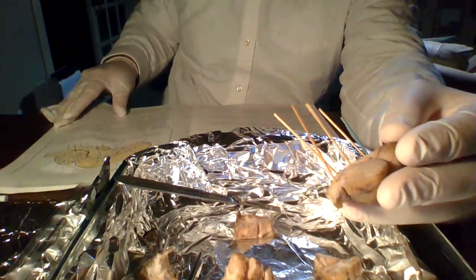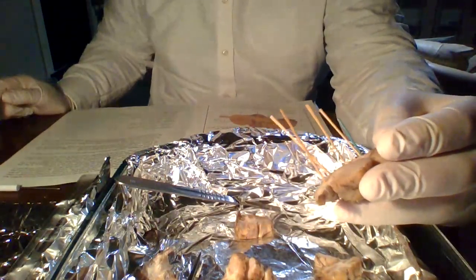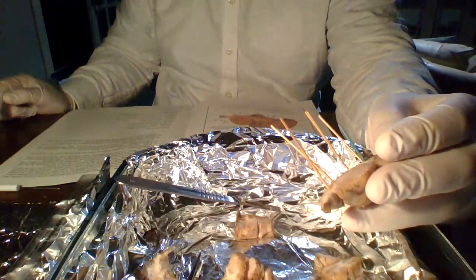I'm guessing the reason why they did wet fixation is because it allows things to move around more. I can tell you that dry fixation, you crumble in your hands.